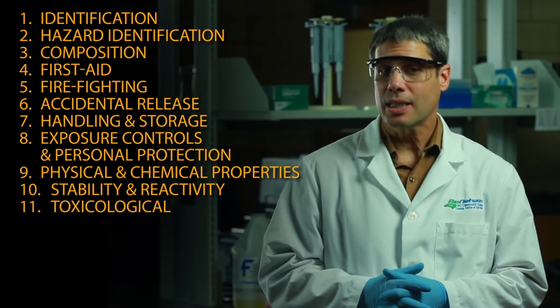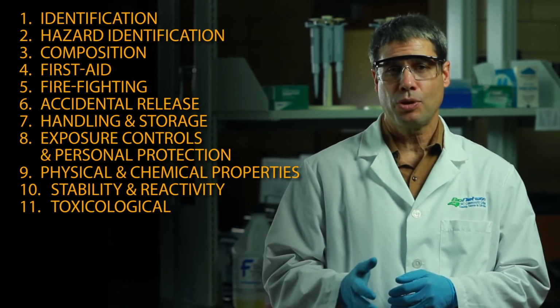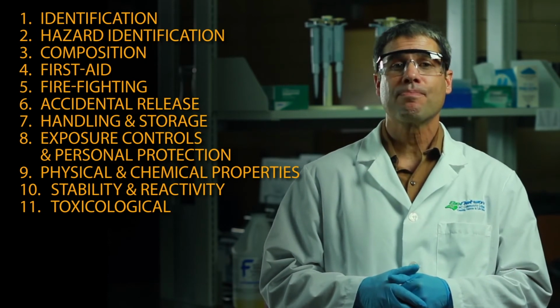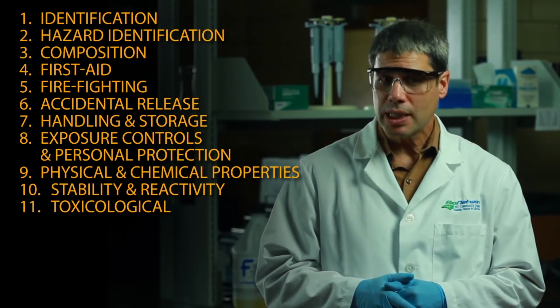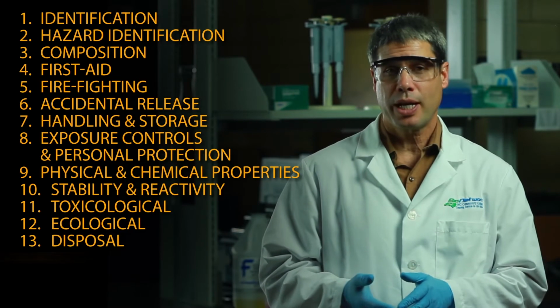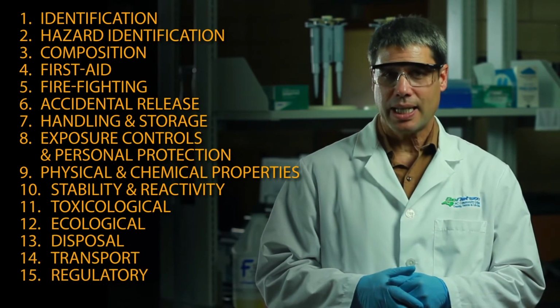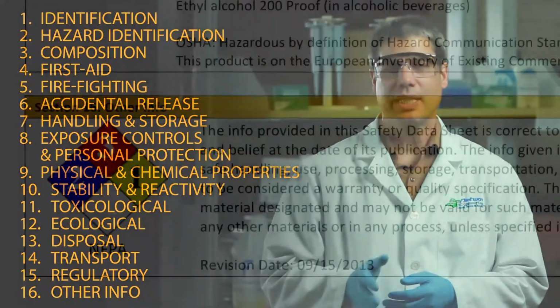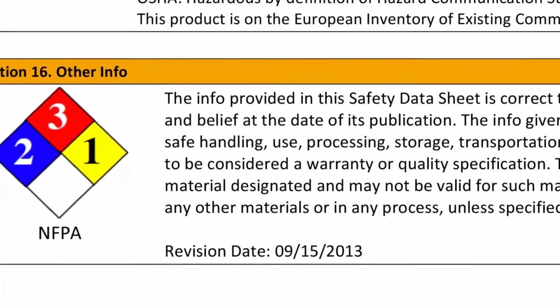Section 11, Toxicological information. Find out about the likely routes of exposure, symptoms, as well as short and long-term effects. Sections 12 through 16 aren't mandatory, but you should at least be familiar with them. Ecological, disposal, transport, and regulatory considerations. Section 16 is for any other pertinent information. This is where you'll find the date that the SDS was prepared along with the last known revision.